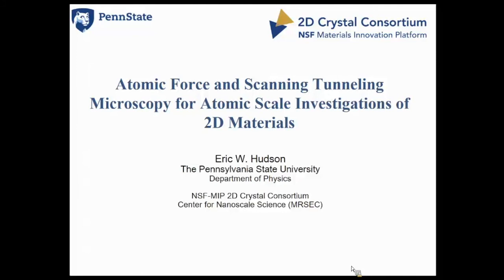Thank you. On behalf of the 2DCC, welcome. What I'm going to be telling you today is about atomic force and scanning tunneling microscopy. This is in some ways a follow-up of a very nice talk that Josh Robinson gave almost exactly a year ago on atomic scale characterization of a variety of materials using techniques that we have available in the materials characterization lab.